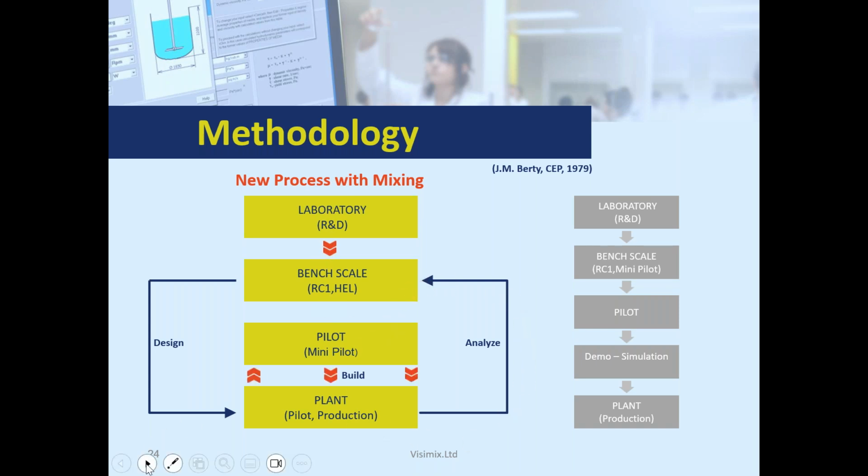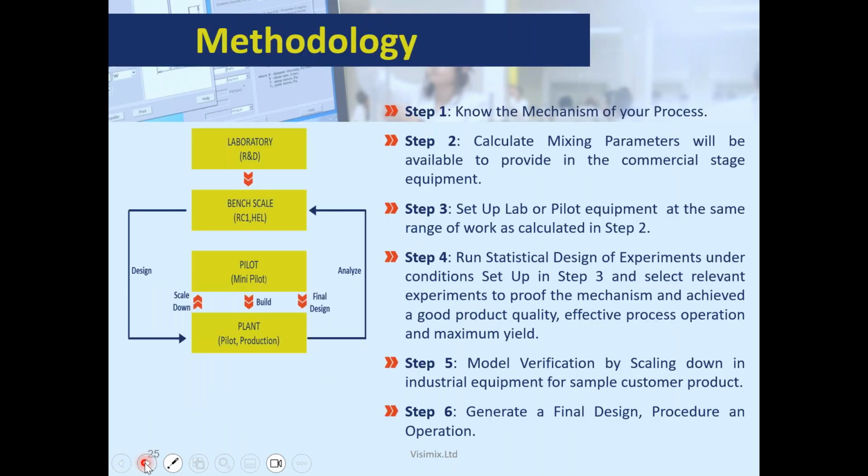Based on it, you will be able to find some solution and get some model that explains your process. So this is the background on the main idea about how to think about mixing, in few words, only to remind you about what we were talking.